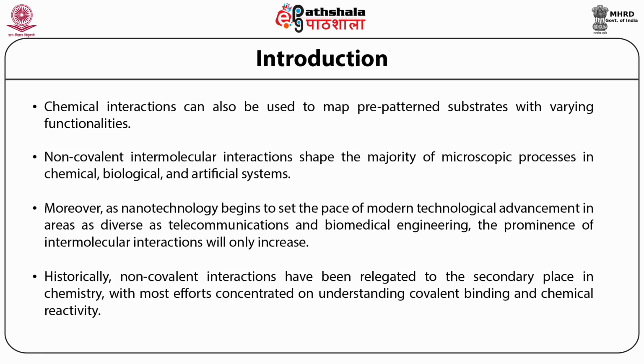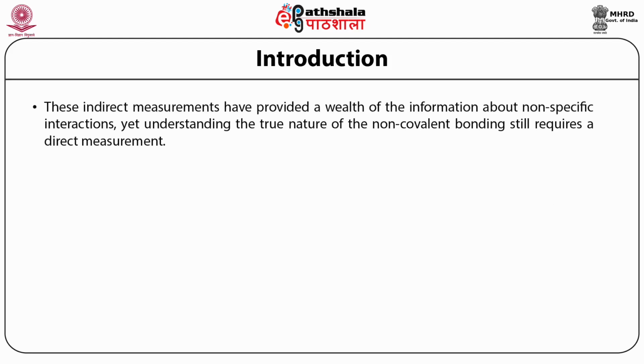Researchers studied non-covalent interactions mostly using macroscopic techniques such as calorimetry, surface tension studies, IR spectroscopy, chemical equilibrium, virial coefficient studies, and elastic modulus. These indirect measurements have provided a wealth of information about non-specific interactions, yet understanding the true nature of non-covalent bonding still requires direct measurement.